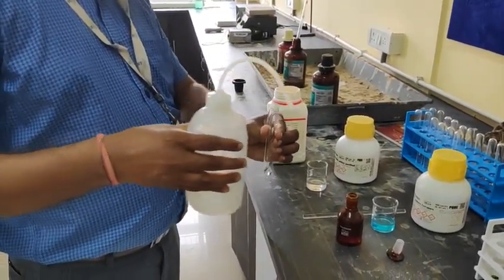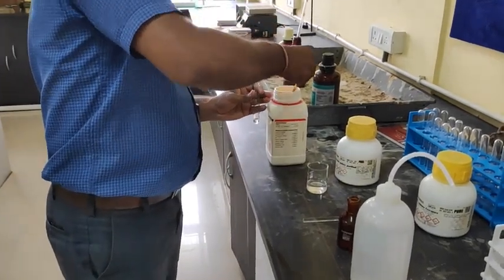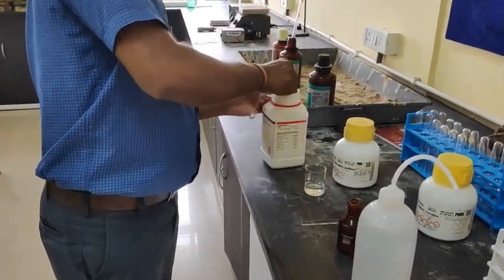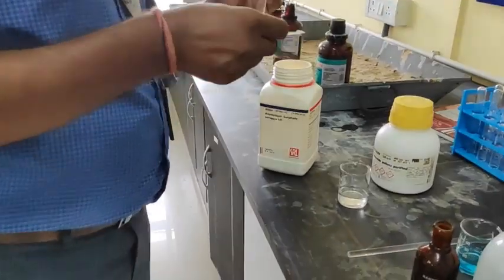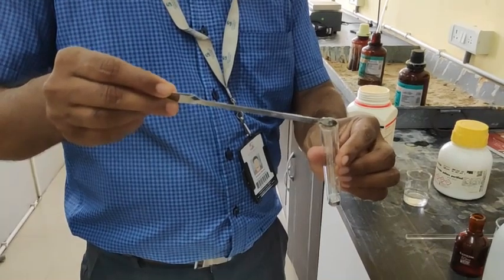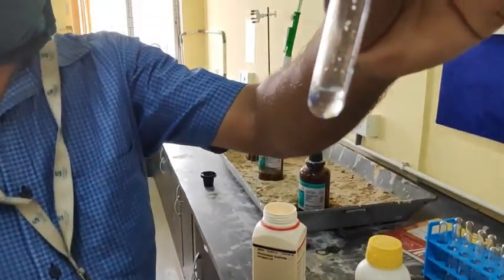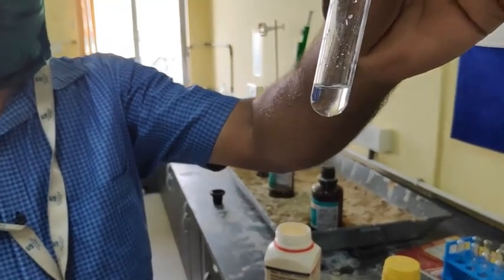And the same thing is happening for the full saturation, where we saw that there is a huge amount of precipitation in the sample. Here he is also adding some amount of ammonium sulfate, as you can see here. As soon as he added some amount of ammonium sulfate, there is again no change. So no change is there, as expected.